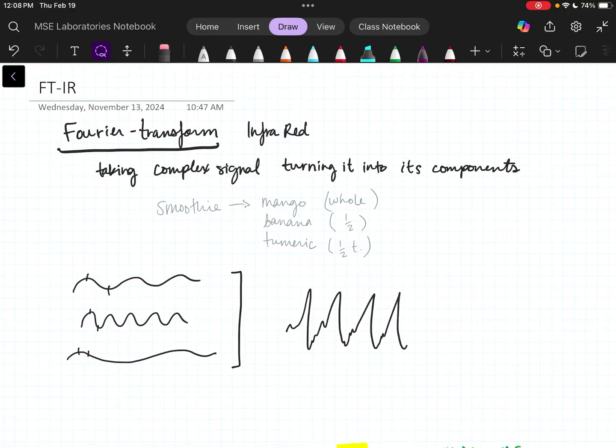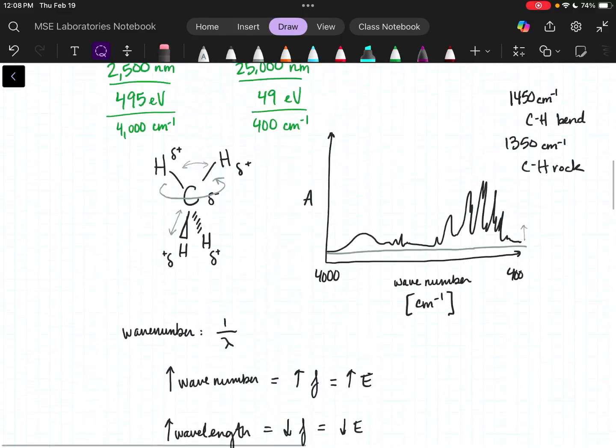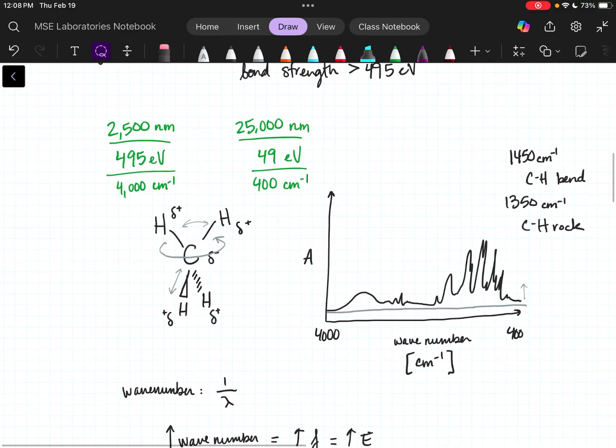And so it knows, depending on the position of that mirror on the right-hand side, which wavelengths might be present so that it can more effectively do, all the way back up to the top, this Fourier transform. It knows what wavelengths are possible, and it can subtract out what wavelengths are and are not there.